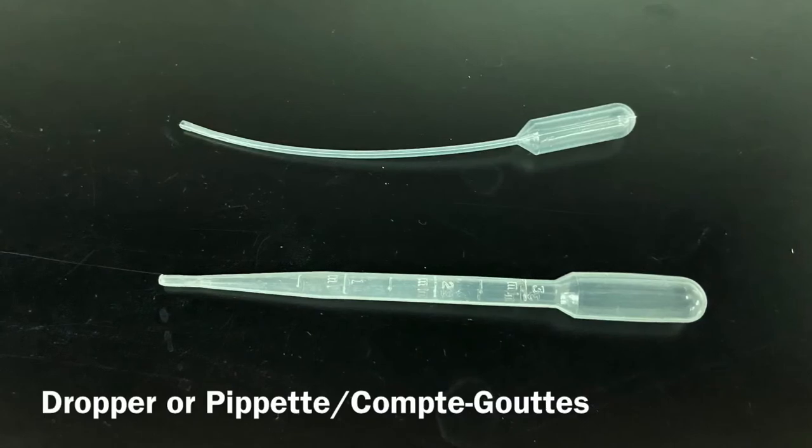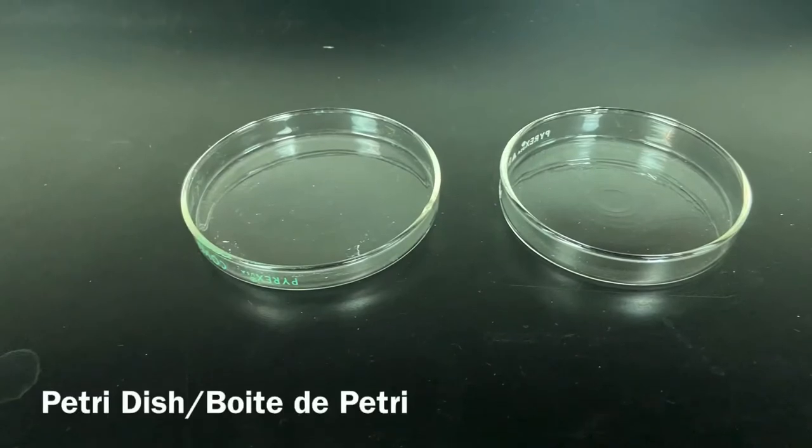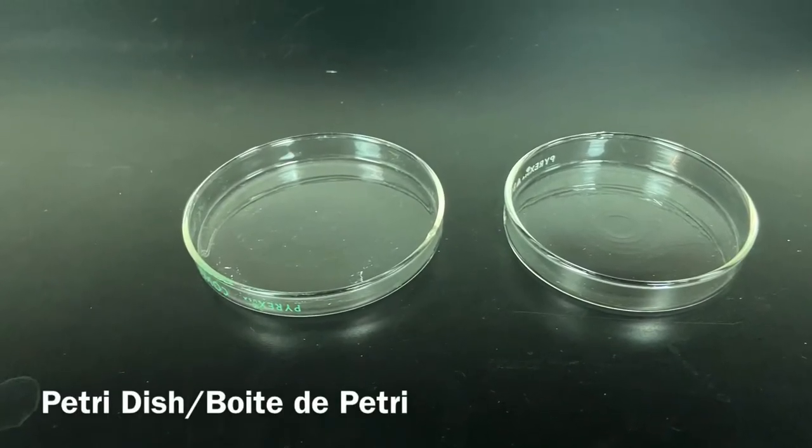Dropper or pipette. Compte-gouttes. Petri dish. Boîte de Petri.